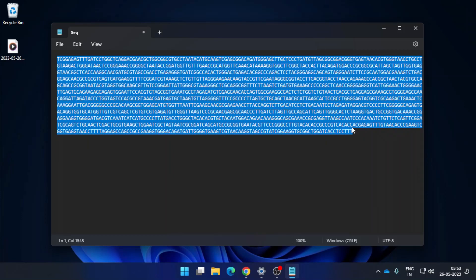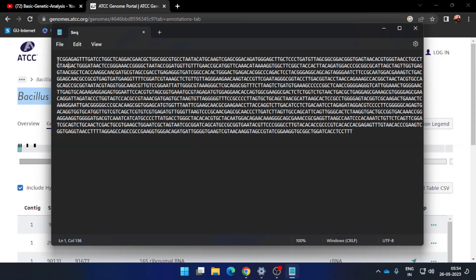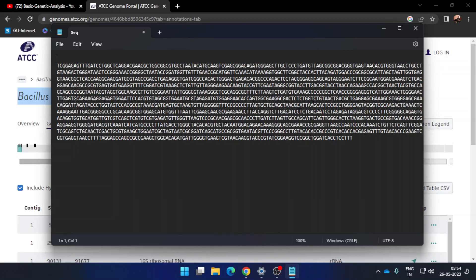The next step is to convert the sequence into FASTA format. Go back to the webpage, copy the entire name of the organism along with the ATCC number, then go back to the Notepad file. At the top of the file, above the sequence, paste the name of the bacterium with the ATCC number. At the very beginning of that first line, add the greater-than symbol (>), and at the back add a comma and write '16S rRNA gene.' This converts the sequence into FASTA format.